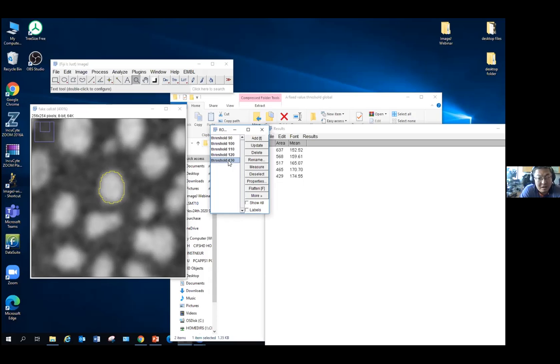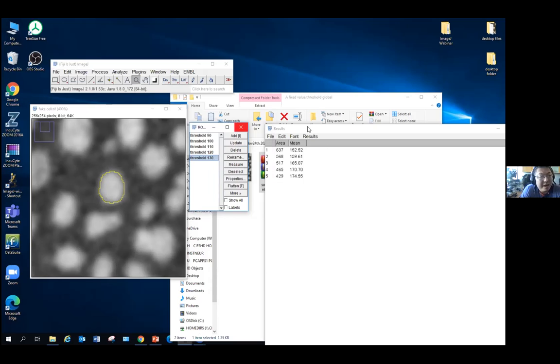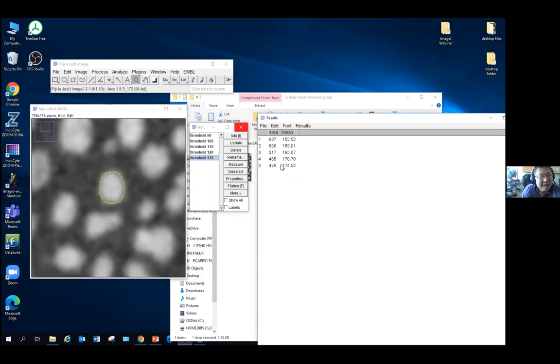And then you will see the problem here: I can give you exactly the same image, and by what you are feeling it should be doing, you can actually create a size difference of 50%. That's a huge difference.